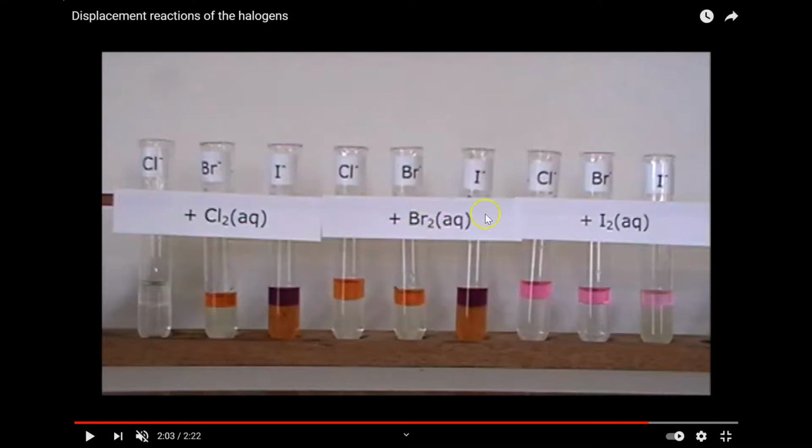Okay? All right. And then here's your I2 with I minus. If you see that kind of pinkish fuchsia color, that tells you you've got I2 in the top layer, which it looks like you do for all 3 of these. Whatever the color of the top layer is tells you the least reactive of the pairs that you're combining.